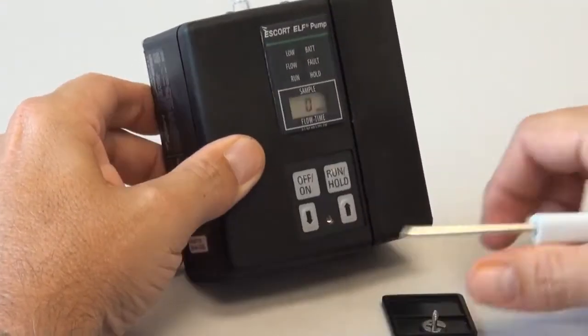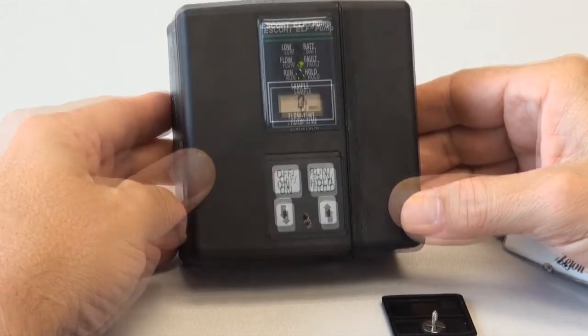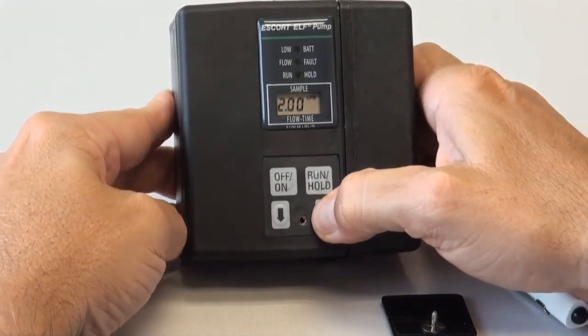First, turn the pump on and let it reach its flow rate setting. If the pump is not set for 2.5 liters per minute, use the flow rate control buttons to set the pump at 2.5 liters per minute.